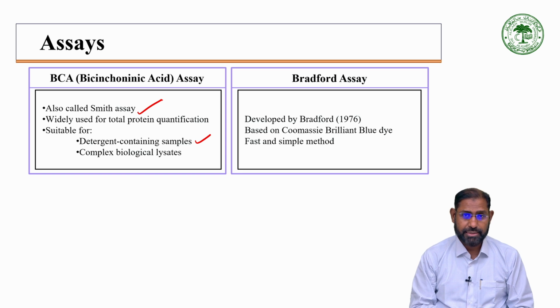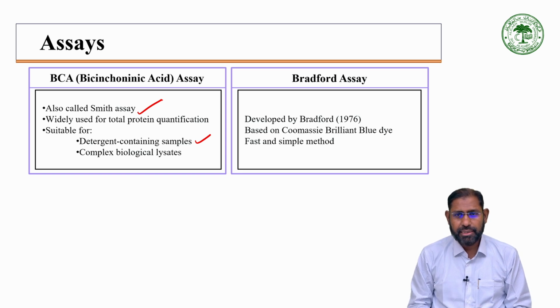Then another assay is the Bradford assay, developed by Bradford in 1976, and it is based on Coomassie Brilliant Blue dye, and it is a very fast and also very simple method.